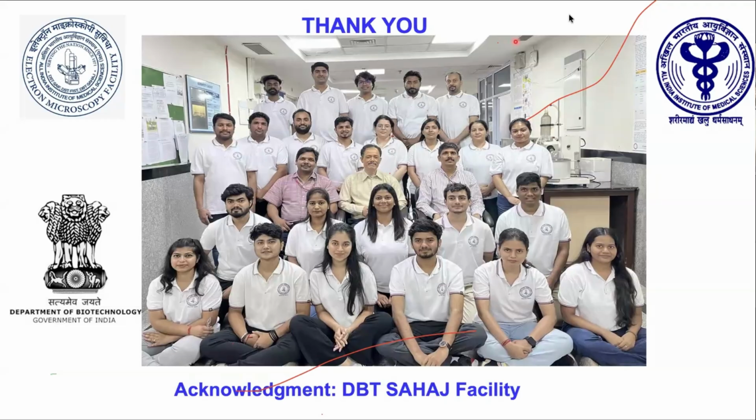If you want to go with only one cell view, then it's going to be a very large field of view. Currently with room temperature slice and view, we could very easily see structures larger than 10 to 15 nanometers. If your patches are 10 to 15 nanometers, room temperature slice and view works. If it's smaller than that, then you have to go with cryo conditions, and there you can use fluorescence-guided methods to easily locate the particular area where it is coming from. Or you can prepare the lamella for that part and go with the detailed structures.